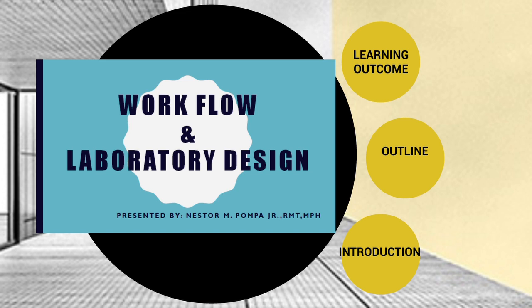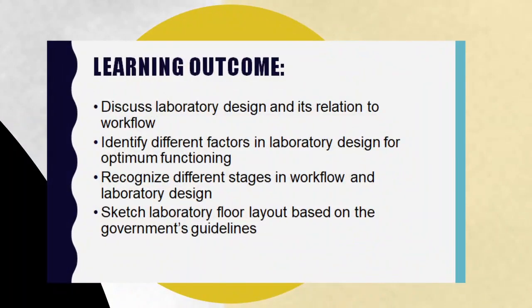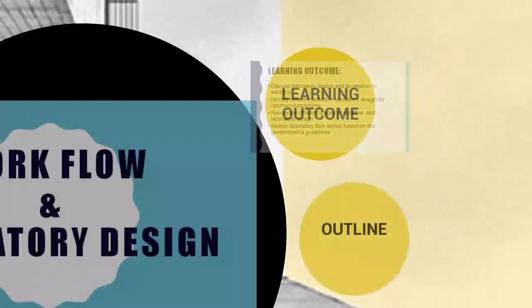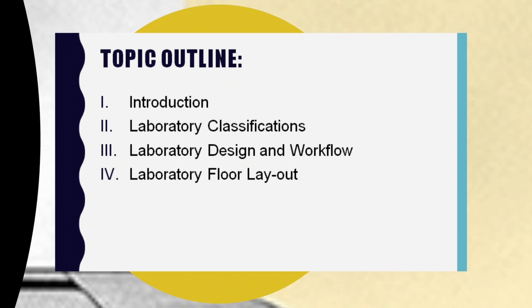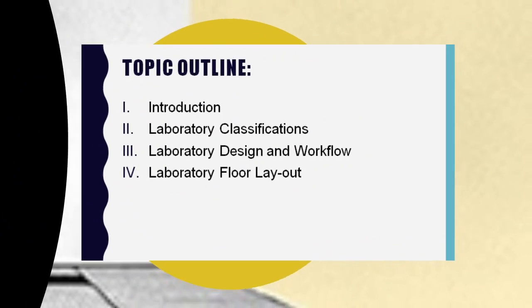a clinical laboratory. Learning outcomes for this topic include discussion of laboratory design and its relation to workflow, identifying different factors in laboratory design for optimum functioning, recognizing different stages in workflow and laboratory design, sketching a laboratory floor layout based on the government's guidelines, and to summarize the lecture, here is the topic outline. We will start with the introduction and end up with laboratory floor layout.